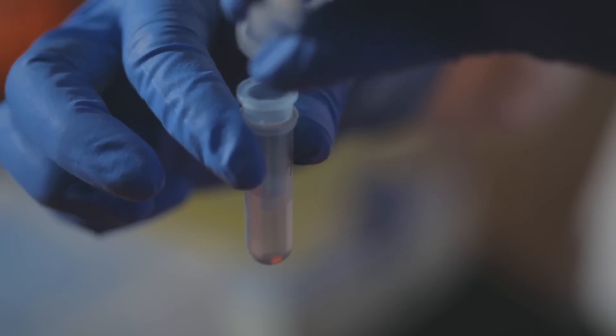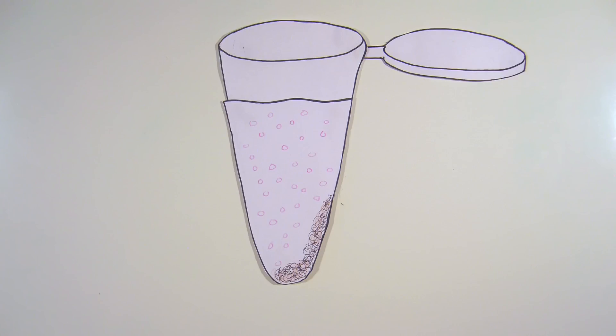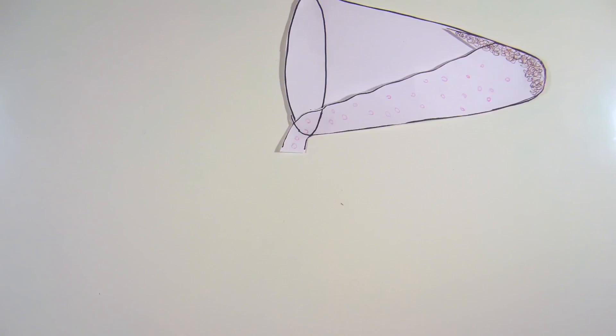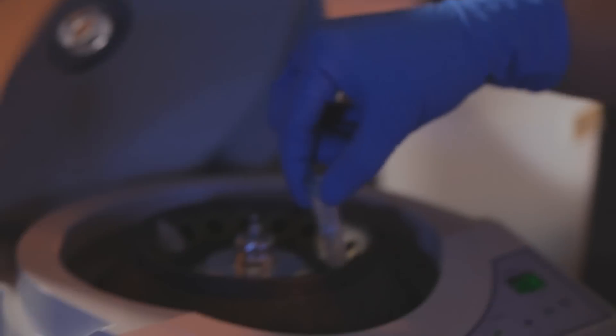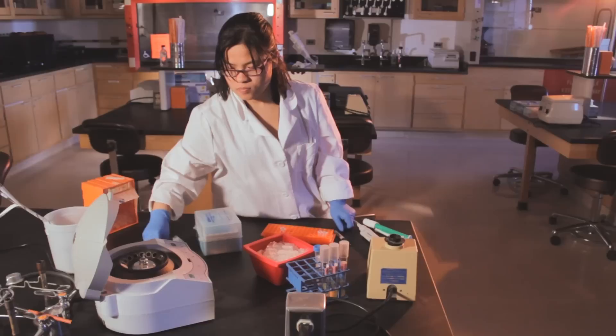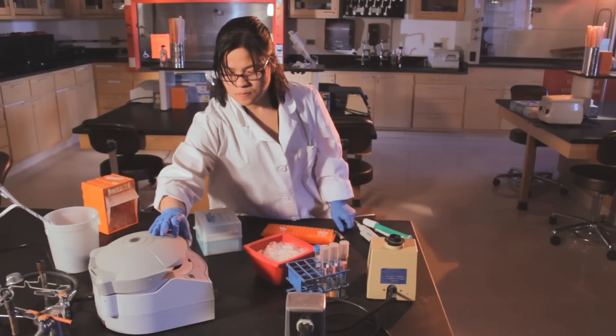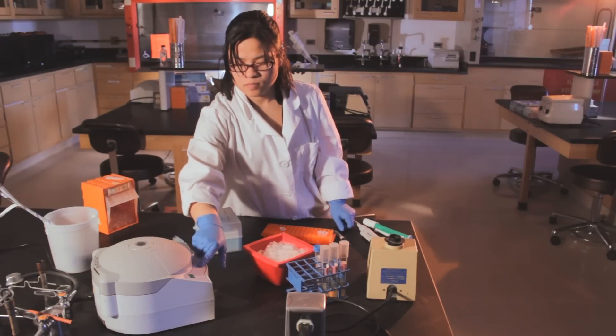Add the clear supernatant to the spin column by pipetting or pouring the supernatant directly into the column. You can now discard the microfuge tube containing the pellet. There is no cap for the spin column, so place it carefully in a microcentrifuge. Remember to balance the centrifuge. Spin for one minute at full speed.